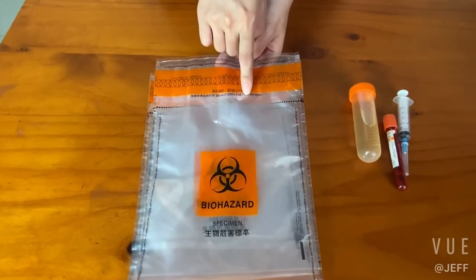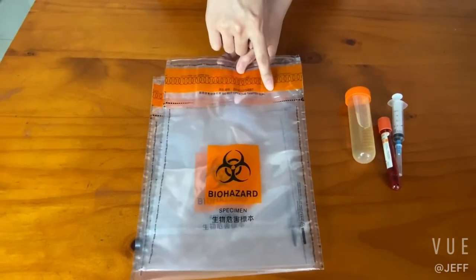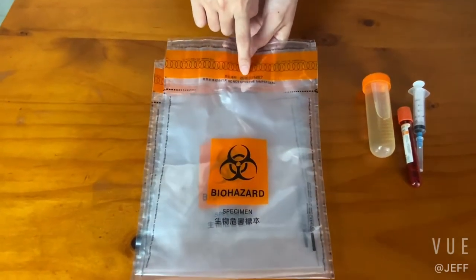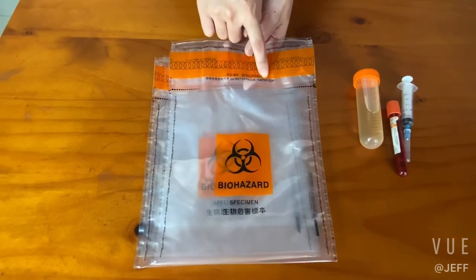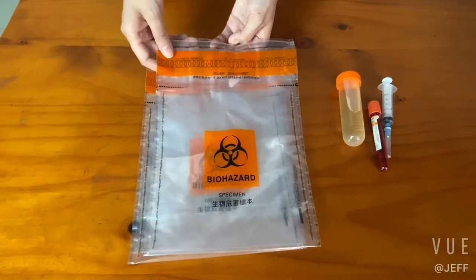It provides an excellent leak-proof function for safe transport of biohazardous materials. Besides, a unique barcode on each bag can prevent the parcel from being replaced.